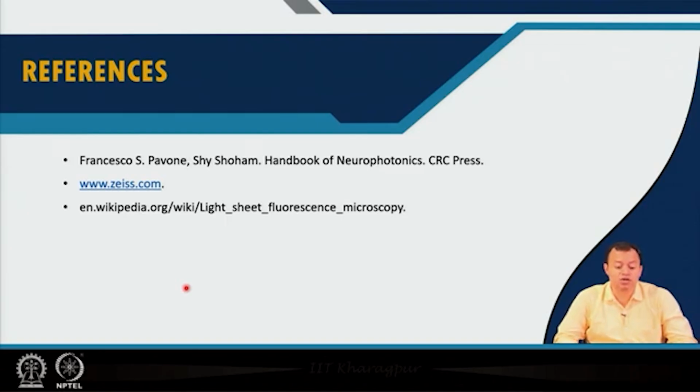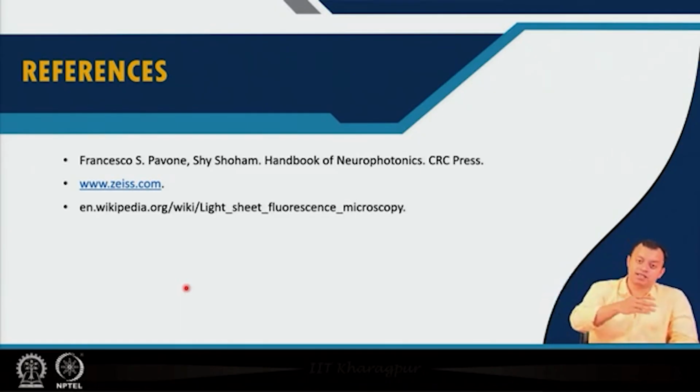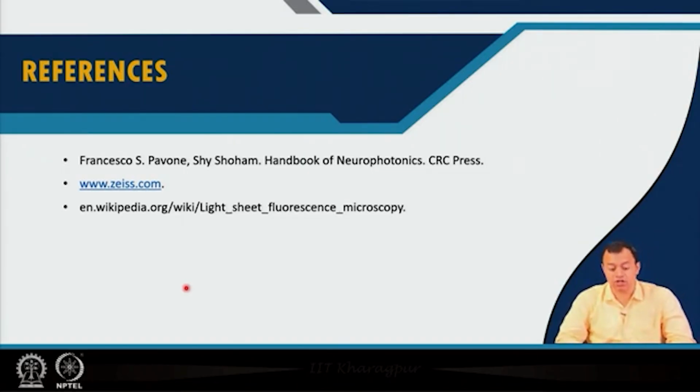Please go through Zeiss.com's light sheet microscopy pages. They have several beautiful videos on social media, YouTube, etc., where you can see. They are copyrighted and they did not decide to give it here, but I will ask you to go and look into light sheet microscopy of mouse brain or zebrafish brain, and you will see the ultra high resolution images of the brain in a 3D format, and what happens to the brain as it performs a particular function, as it goes on developing, as some sort of pathogens have attacked. So, Zeiss have several beautiful images, beautiful videos on this topic.